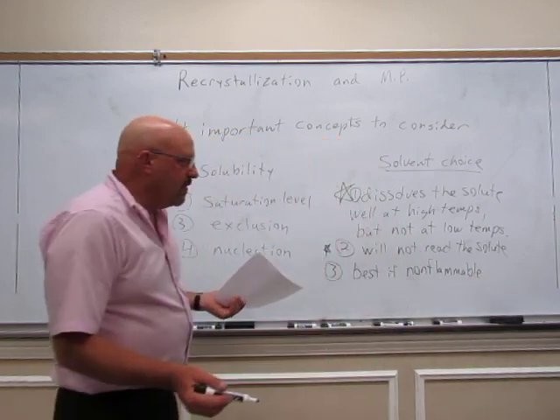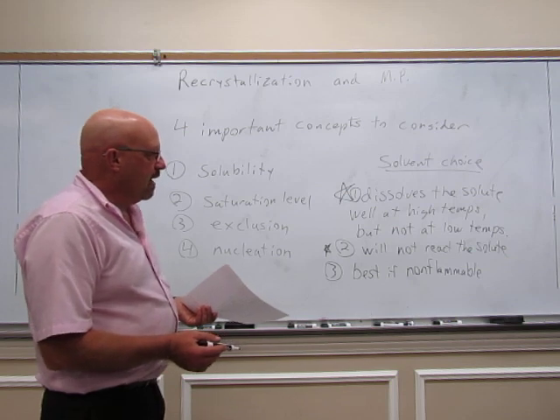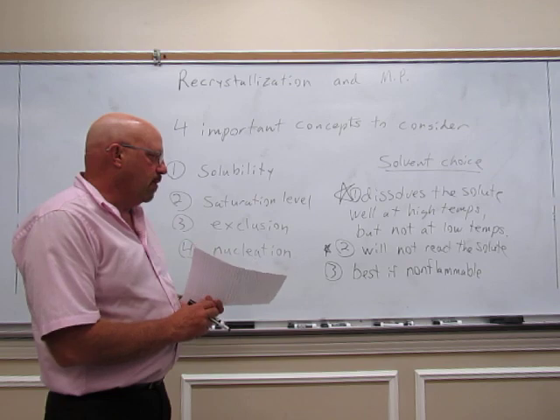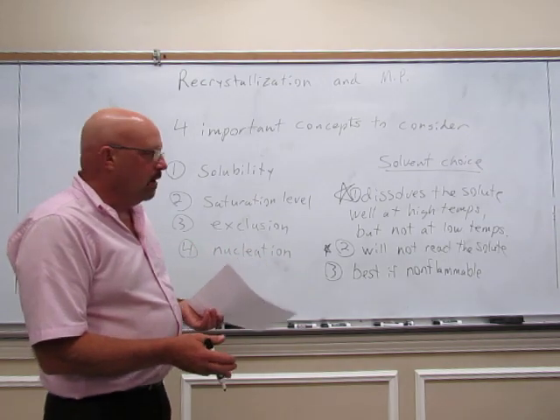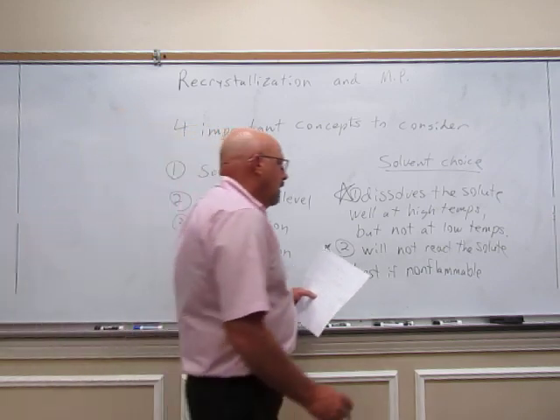Now that's just nice, then we don't have to worry about a fire when we're recrystallizing. So it's nice if it would be non-flammable, but it's not an absolute requirement. We can use flammable solvents, we just have to be a little bit more careful.